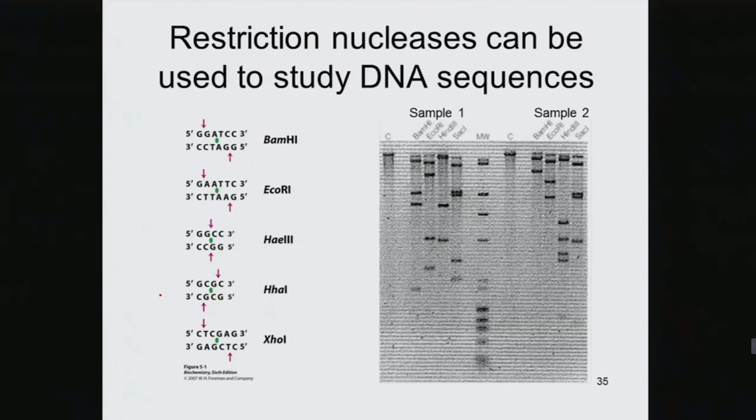Okay, so that's great. We can separate these fragments and we can look at the patterns and maybe identify some types of sequences. What is it good for? Well, it can actually help you if you have different samples of DNA to look at the similarities. Are there similar sequences within these different samples?